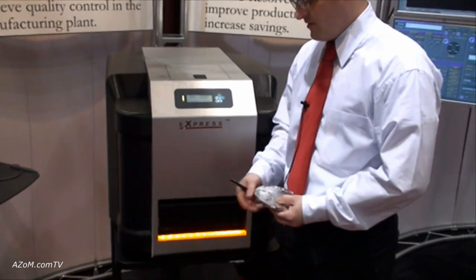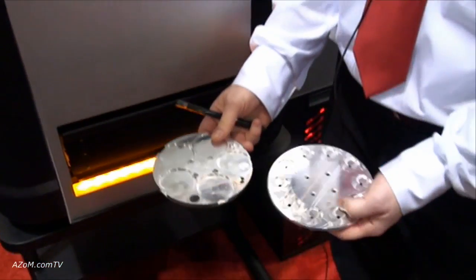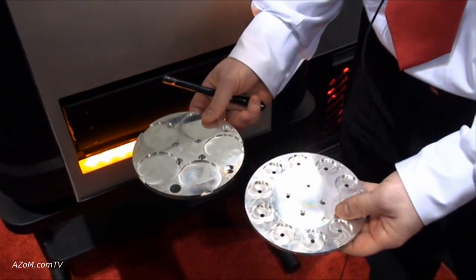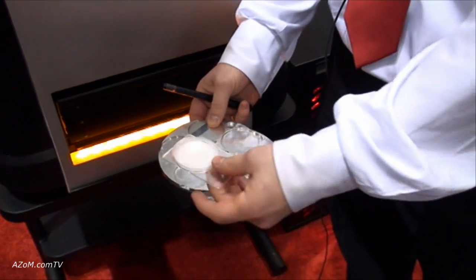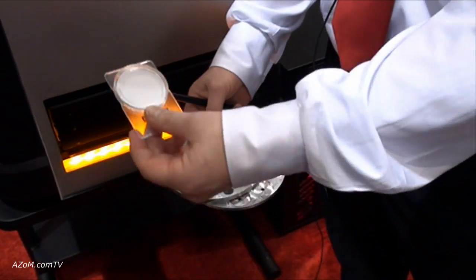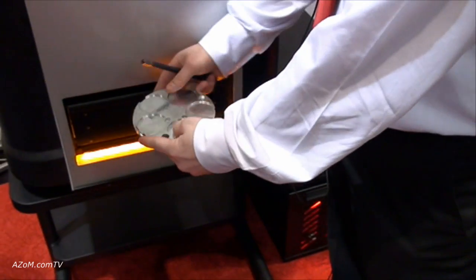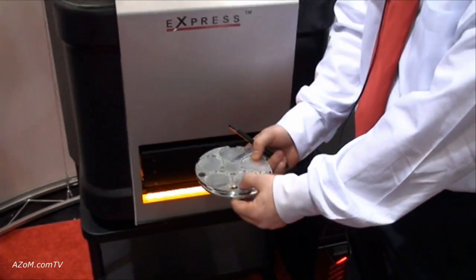The pump-down takes about two and a half minutes. You can also put different types of sample holders into the chamber. For quality control purposes, we can analyze 47-millimeter filters. Once your material is set onto the surface, place them onto the carousel, load it into the chamber, and use the rotate module to scan through each sample.